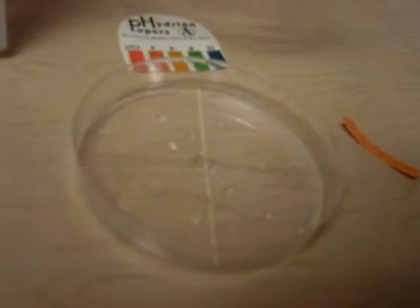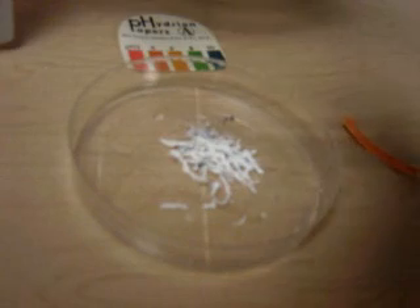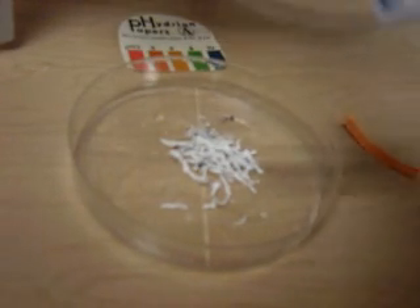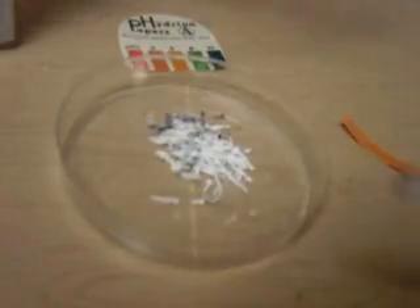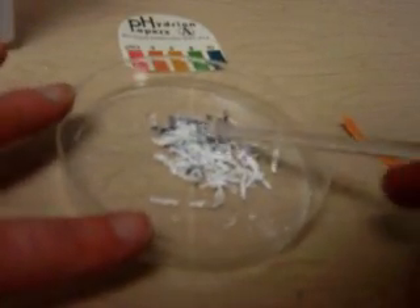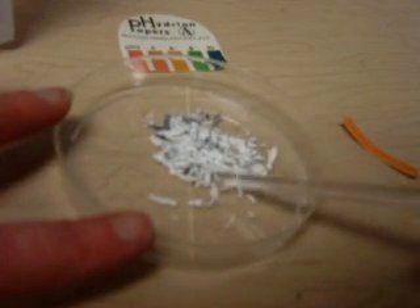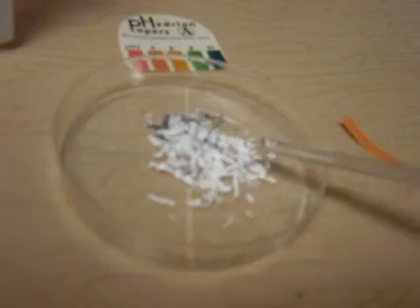I'm going to take the Magnesium Oxide that I got as a product from burning Magnesium Ribbon. This is what I got — Magnesium Oxide, which is a nice white powder.